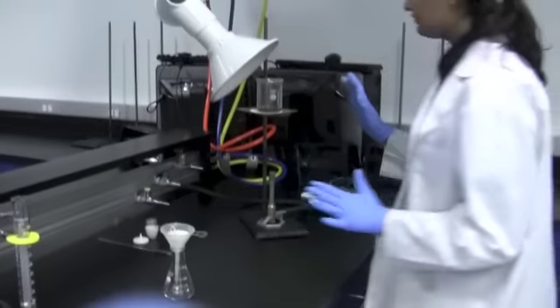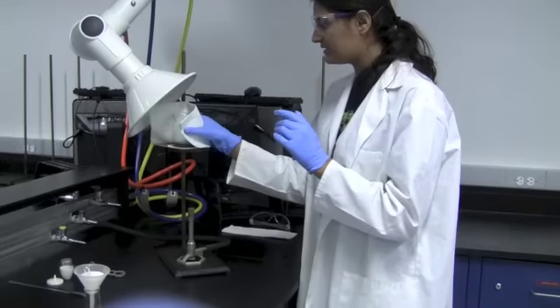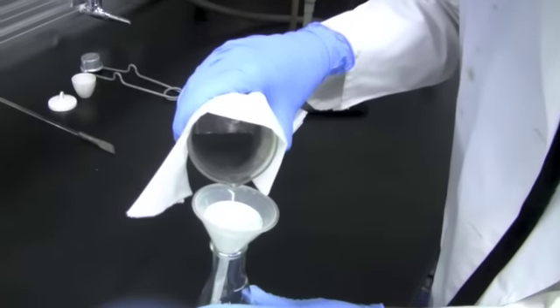You're going to now place the funnel inside the flask. And remember, you're filtering while the solution is still hot, so you're going to want to hold it very carefully with paper towels. Bring it over to your flask and slowly add the solution.